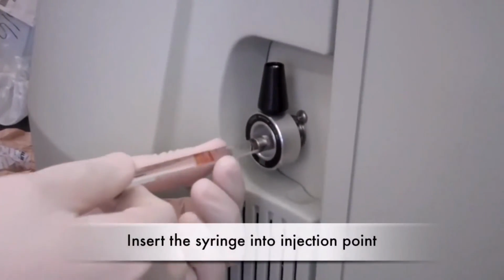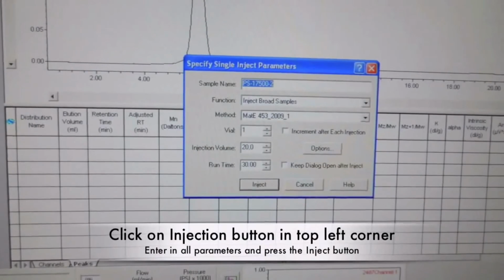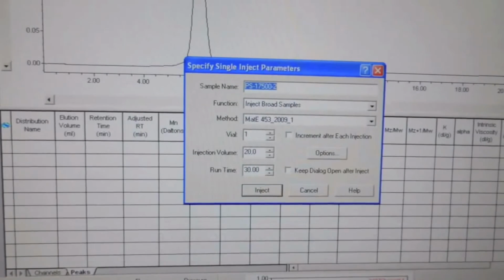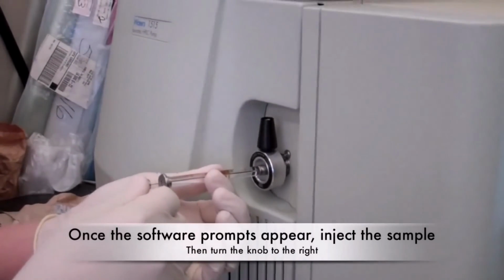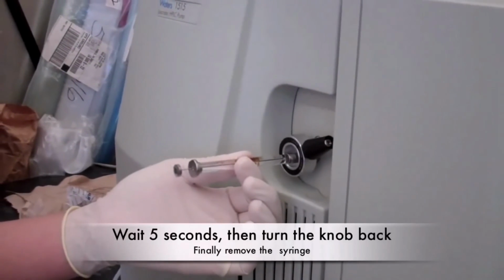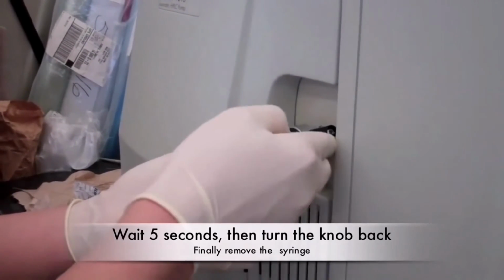Next, put the syringe into the injection point. Click on the injection button in the top left corner in the software and enter in all parameters, including the name of your sample. Click on the injection button in the software and wait for instructions. Once the instructions appear, slowly depress the syringe to inject the sample. Then turn the knob to the right and wait 5 seconds. After 5 seconds, turn the knob back to the left.